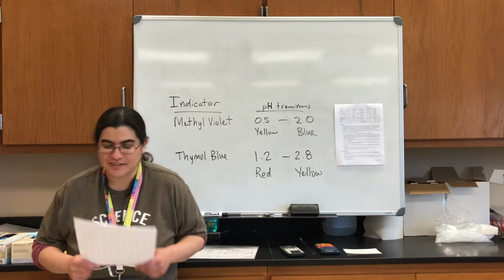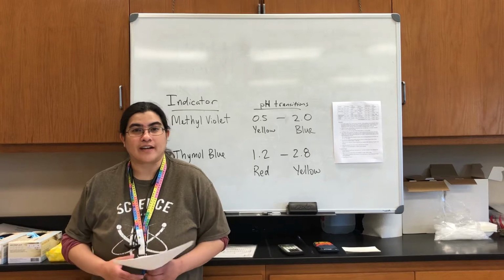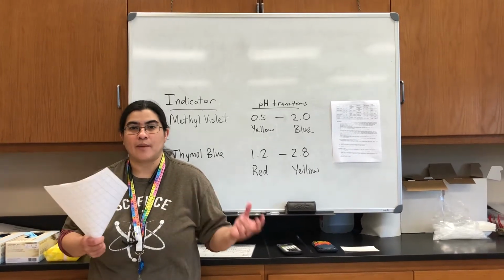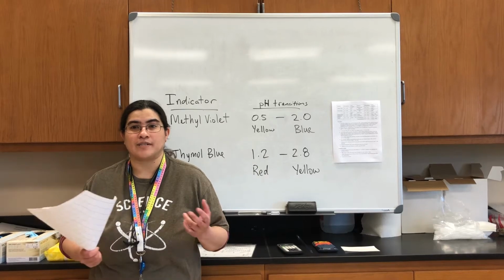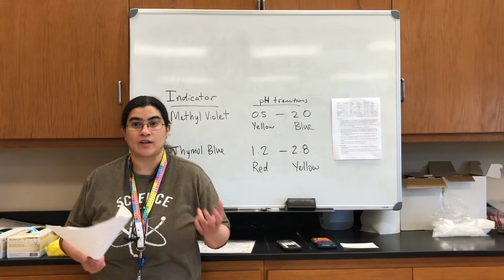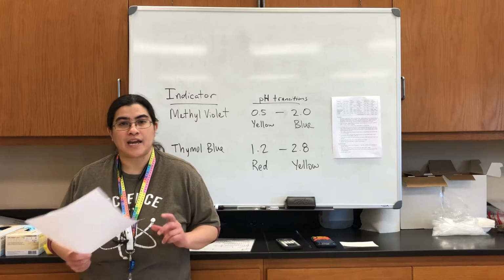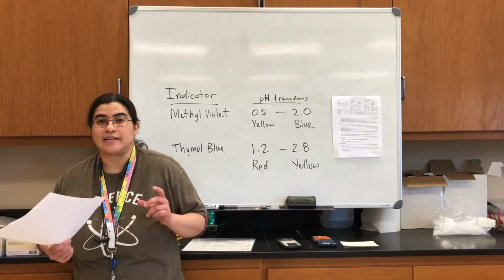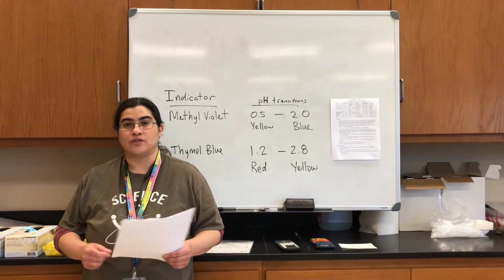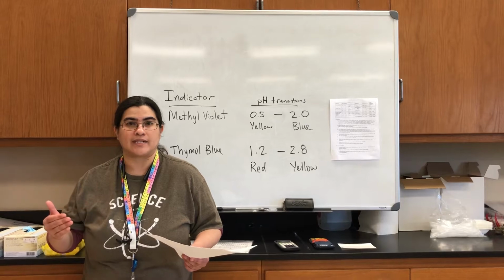Whichever one, who knows. In any case, today's lab is about pH, which you should have covered in lecture already. And the pH tells us whether or not some chemical is acidic or basic. And this comes in handy in everyday life where you might need to know if some food you're eating or something you're drinking is acidic or basic. And so to determine pH ranges, one thing that you could use is an indicator solution. So with that solution, when you add it to a solution, it will be a different color depending on whether the solution's acidic or basic.